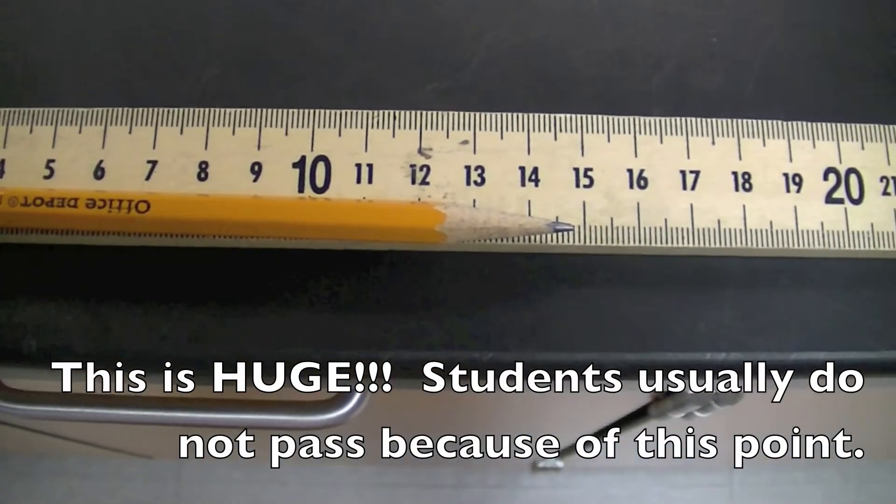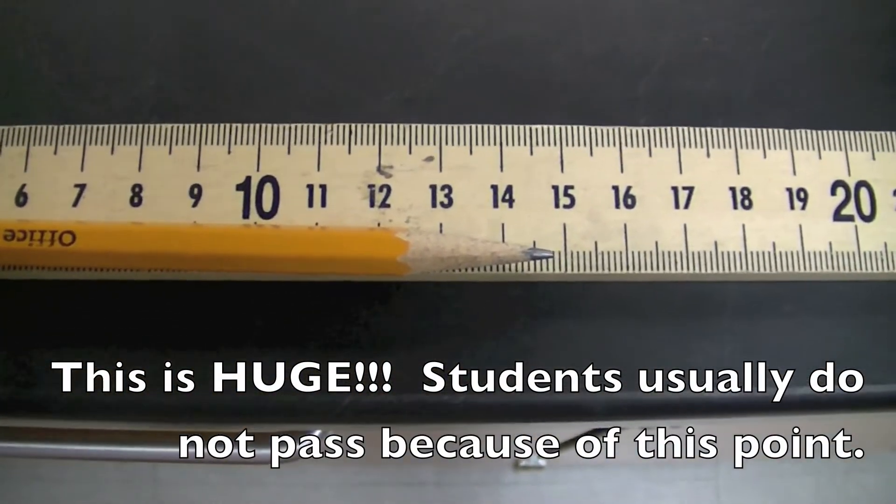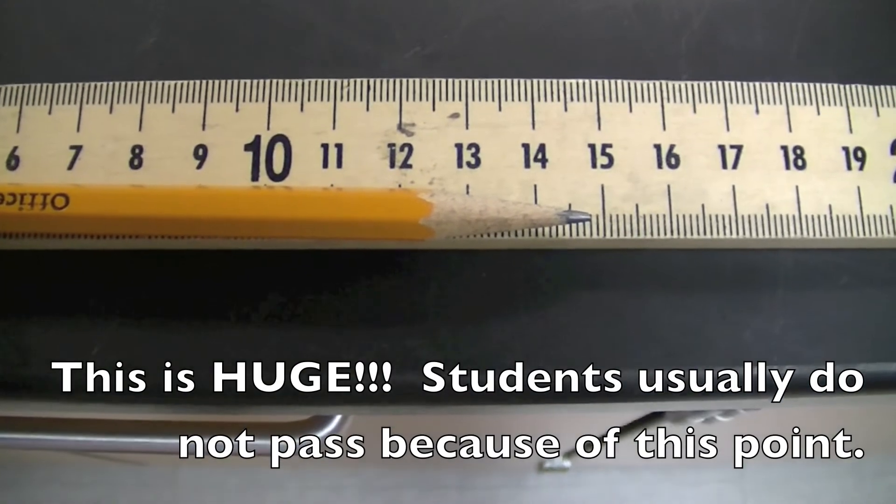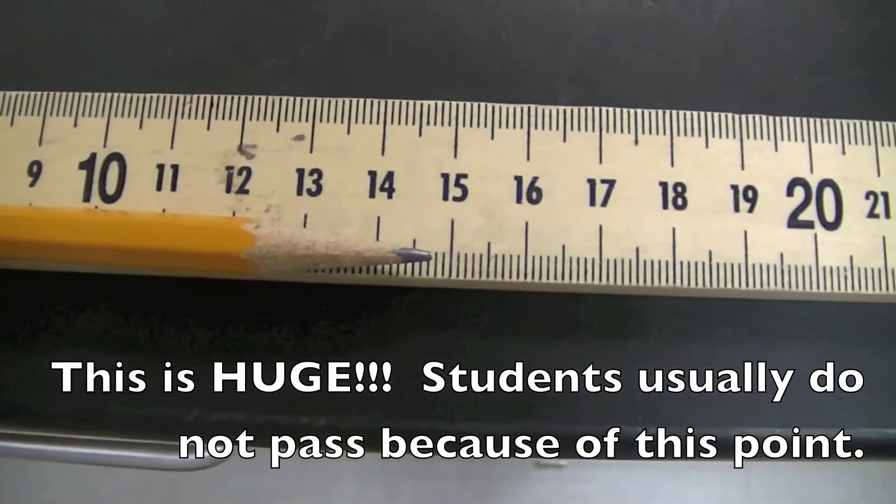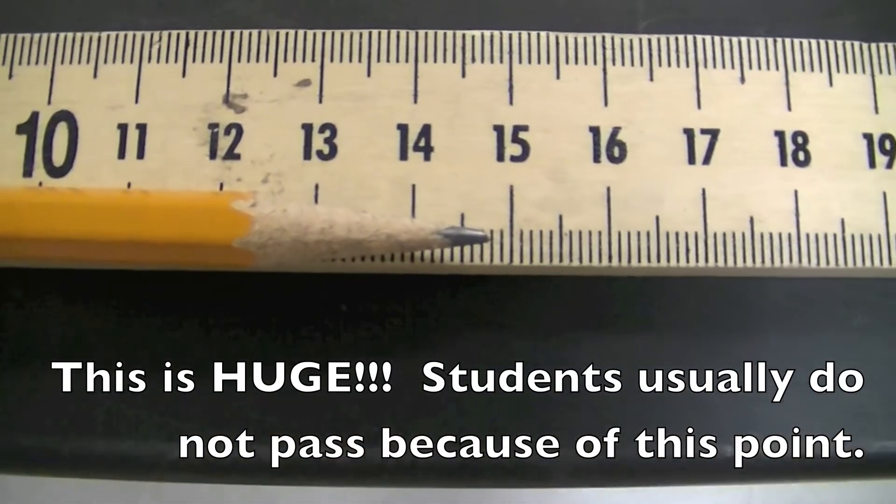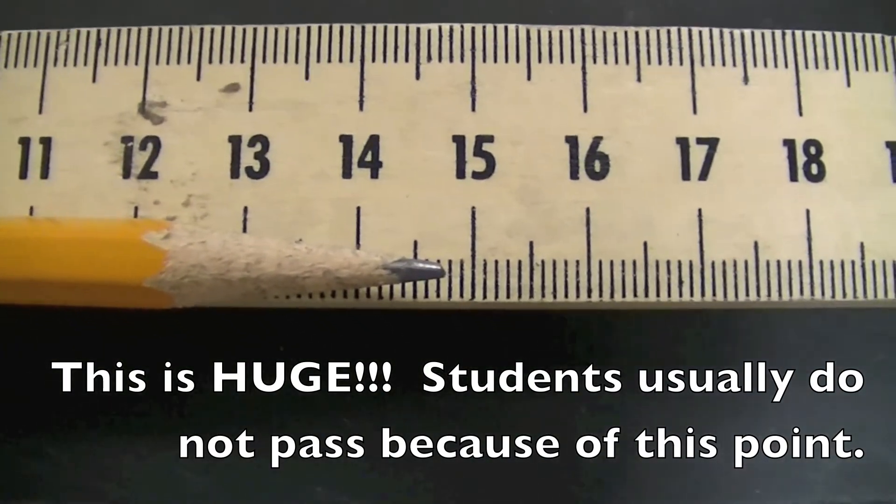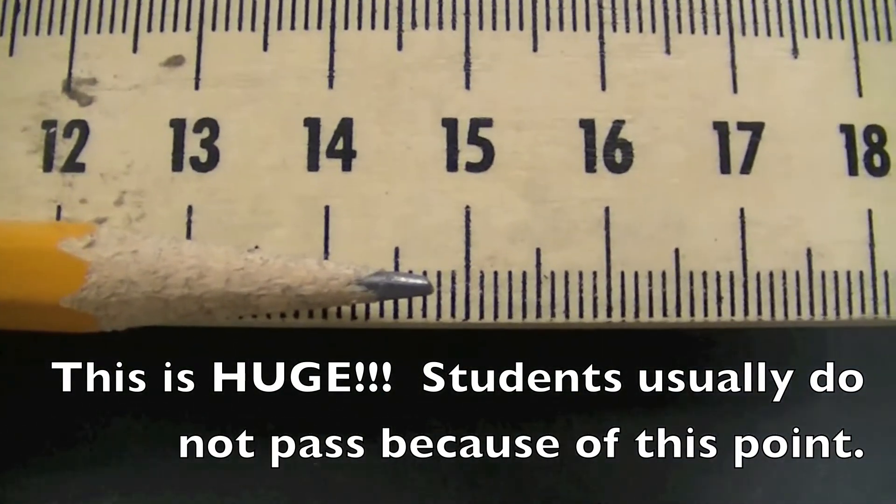Any time there are graduations or markings on a measuring instrument, we always want to estimate one digit past the graduations. What does that mean? Well, we want to be as close as we can when measuring something. So by estimating this, our calculations can be more accurate.